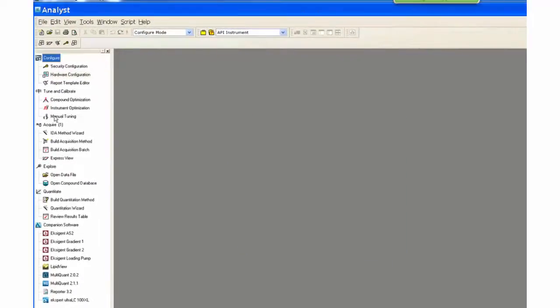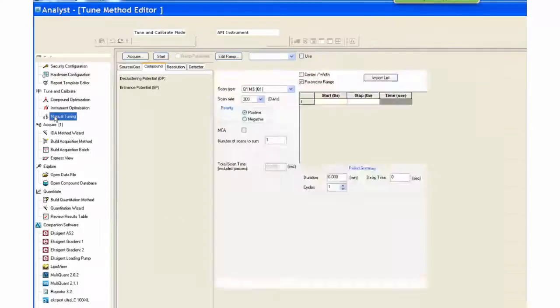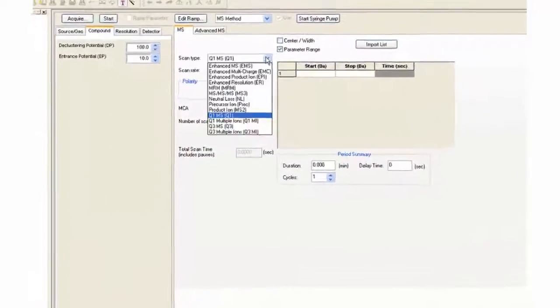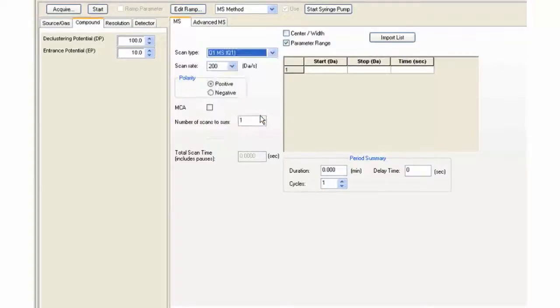Open the manual tuning window. First, select the proper scan type. Here, we will perform a Q1-MS scan.